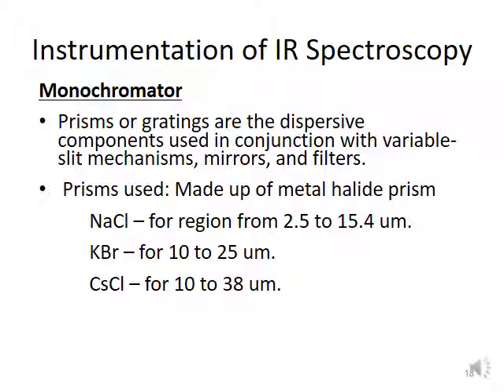This prism is actually made from an ionic compound, so it has ionic bonds.